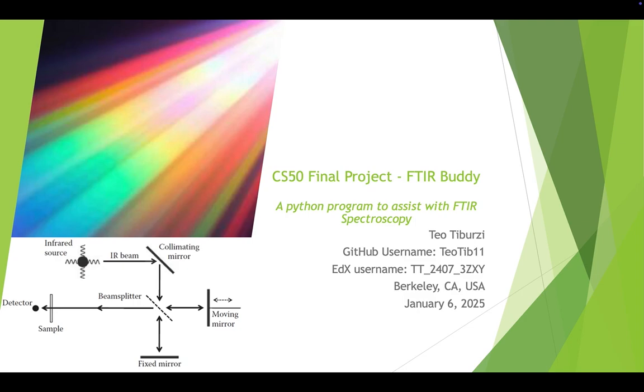Welcome to my CS50 final project. My name is Teo, and this is my program FTIR Buddy, a Python program designed to assist with FTIR spectroscopy.